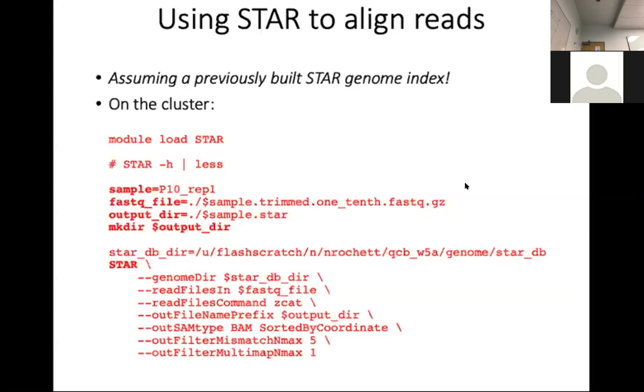Oh, that's just to cd to the directory of the company. Yeah. So one dot always means the current, the present directory. Two dots, the directory above the present one. cd with one dot works, but that does nothing. That changes to the directory where you already are. So that doesn't do anything, but it's legal.